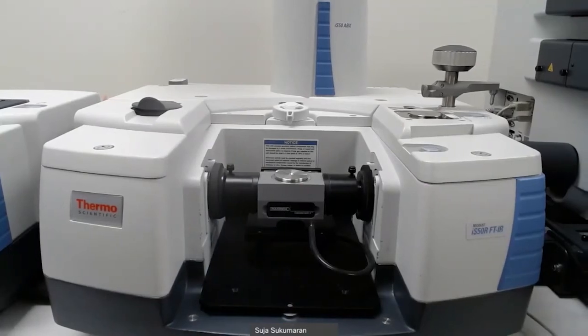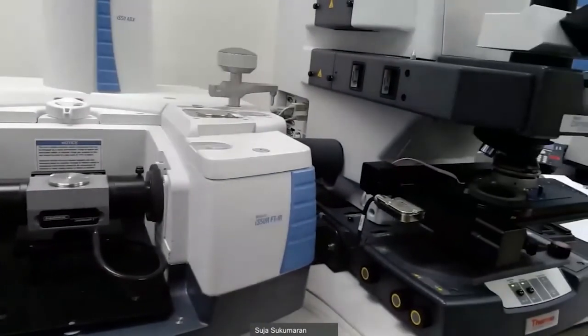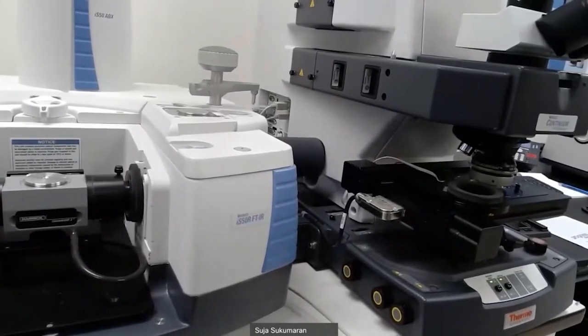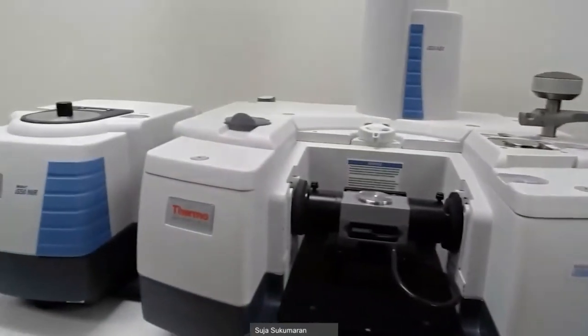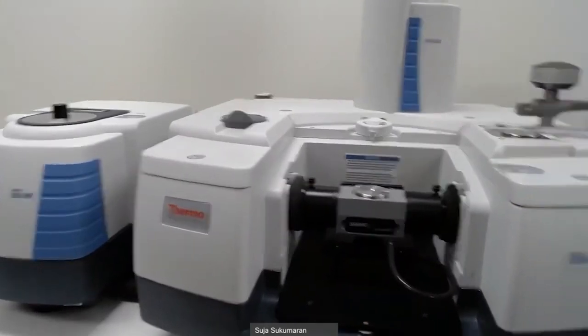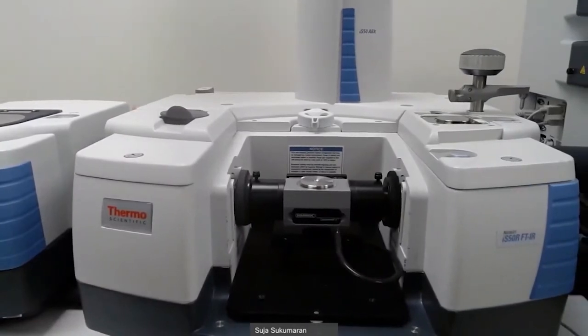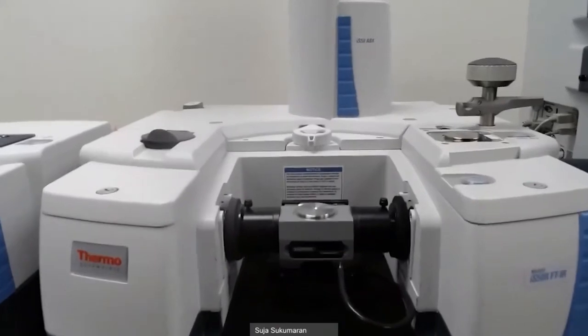Just to give a quick overview of my instrument by itself, on the right side, I have this connected to the Continuum microscope as well. And on the left side, it is connected to the IS50 near-infrared module. But we are going to focus on the main sample compartment as well as the built-in FTIR for today.